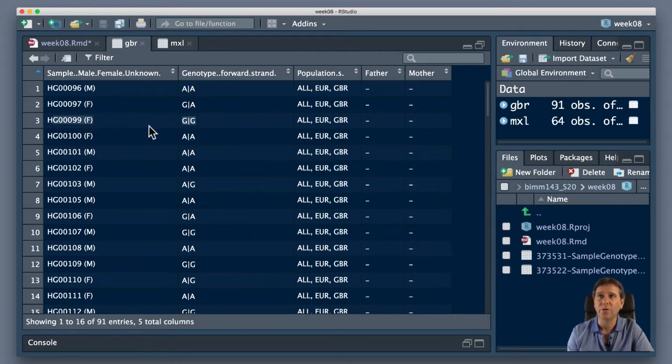something like this. We'll pick one that's homozygous for this allele, like this male HG00107, right? That's the code for this individual, and they're GG. Let's go and see. We can go on to the 1000 Genome Project, pull other data for this individual via that code HG00107, and analyze that data and see if it affects the expression of those genes that were in this region, right? If this really matters, maybe this type of individual has an altered gene expression for those genes that seem to be important for asthma. That's one thing we could explore, one follow-up.